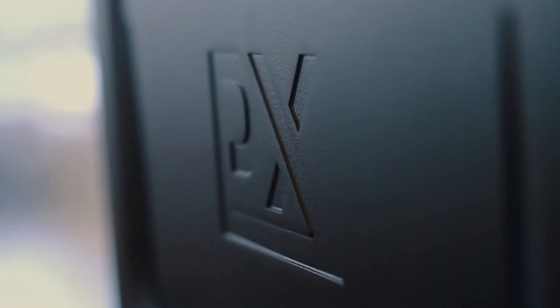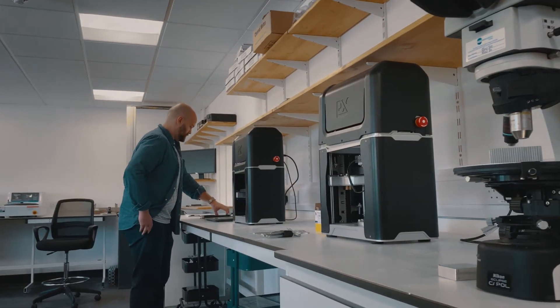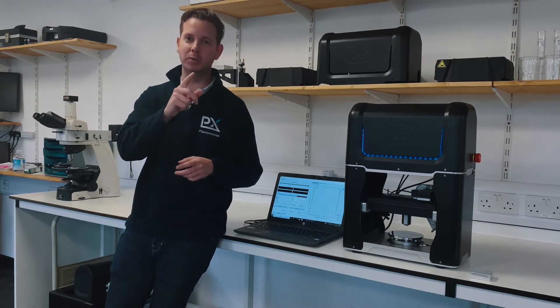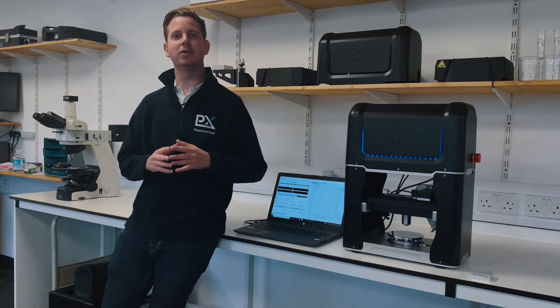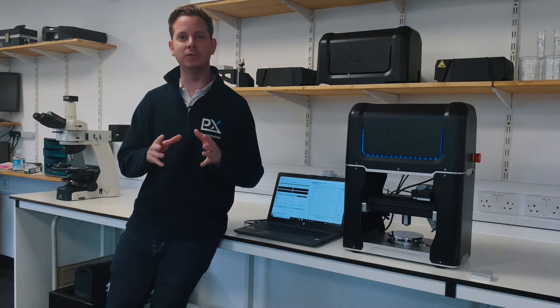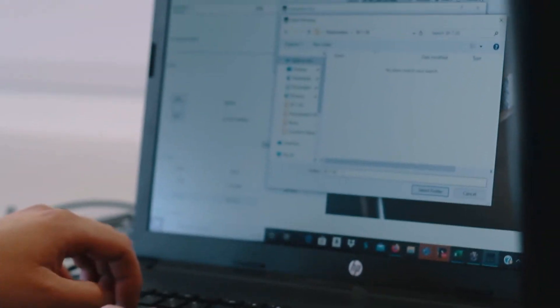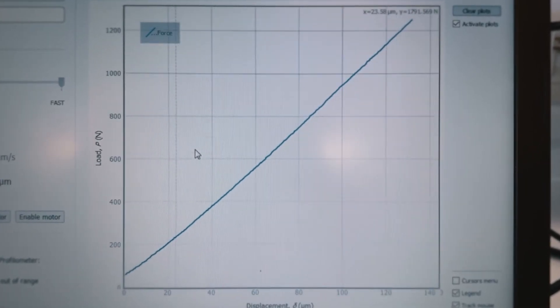This is our benchtop indentation plastometer which is undoubtedly the best-looking mechanical test machine on the market right now, but more importantly it is a macro mechanical test machine that measures stress strain curves from indentation test data, and it does this in a way which is substantially quicker and far more convenient than conventional tensile test machines.